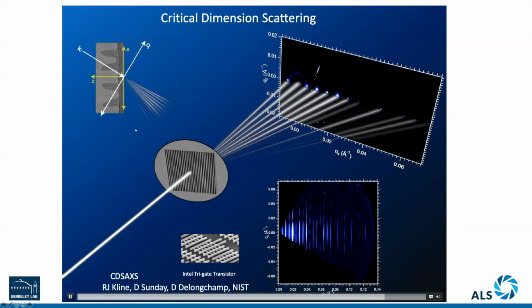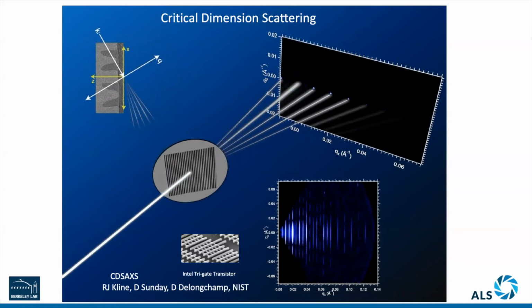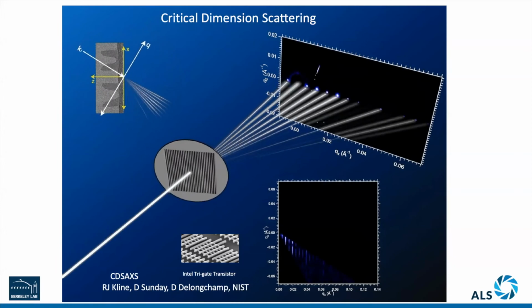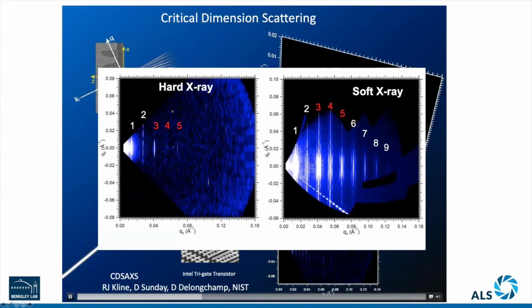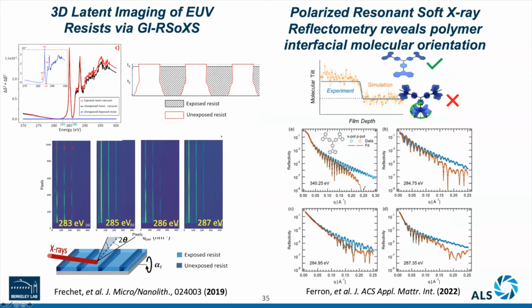So this has drawn quite some attention from the semiconductor chip manufacturing industry. And back then, there were a lot of work using the polymer-based directed self-assembly. For those thin films, only about 100 nanometer or 50 nanometer thick, the hard X-ray simply doesn't have enough cross-section. Therefore, the soft X-ray version of the same technique reveals a much enhanced intensity. Scattering really gives rise to the fine details of the 3D grating structure. And based on that, it was extended to different geometries.